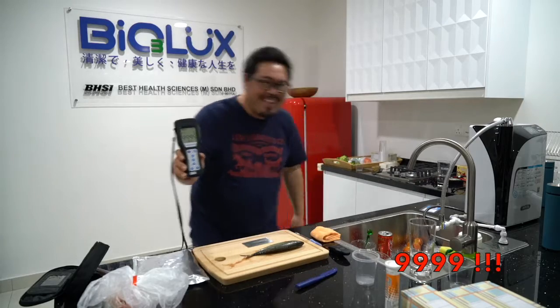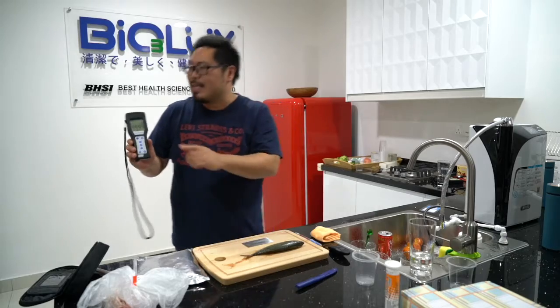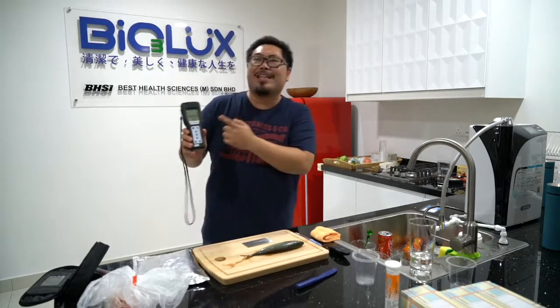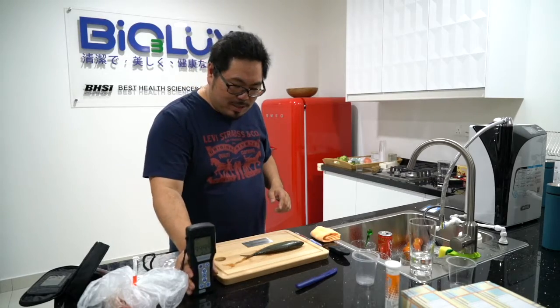Nine thousand, nine hundred. So yeah, above a hundred means heavily contaminated. This is nine thousand, nine hundred and ninety-nine. It's crazy, yeah.